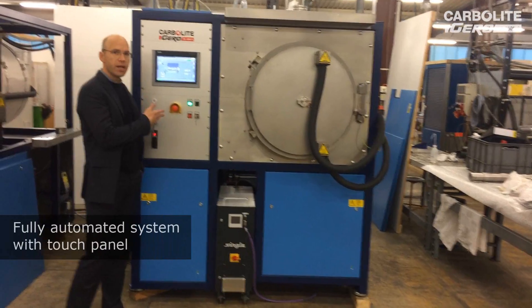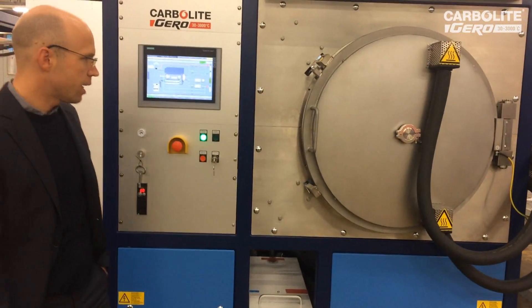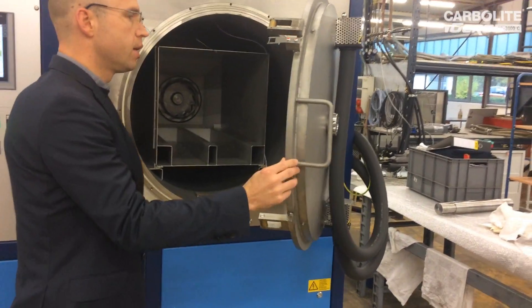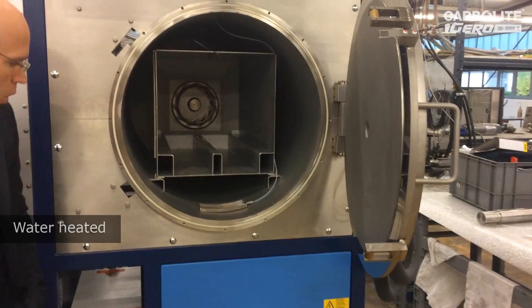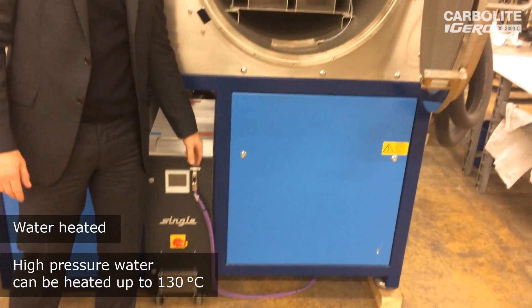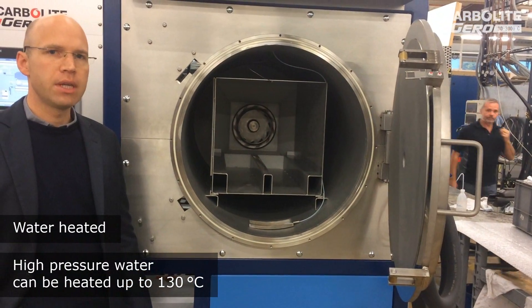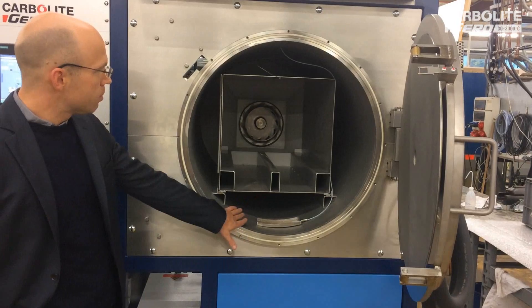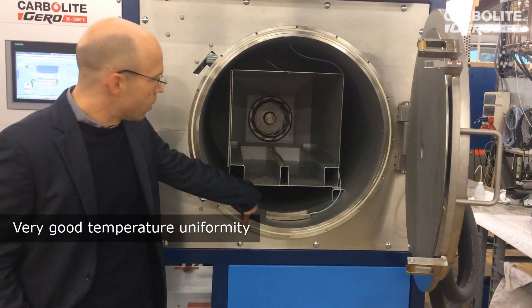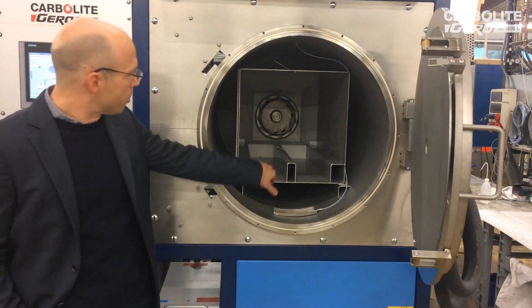It's a fully automated system with a touch panel, and if we have a look inside we will see a little bit more of the details. This furnace is heated by water — we see the heating and cooling device here. We can heat up the high-pressure water up to 130 degrees C at most, which gives us very good temperature uniformity inside.